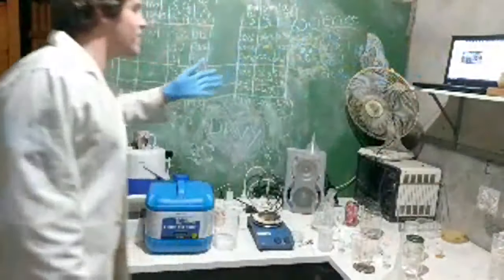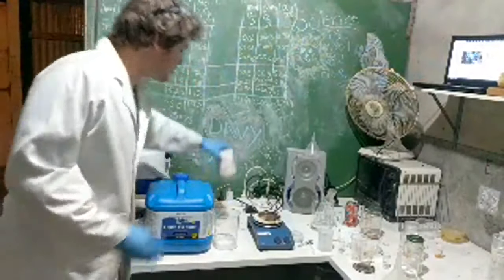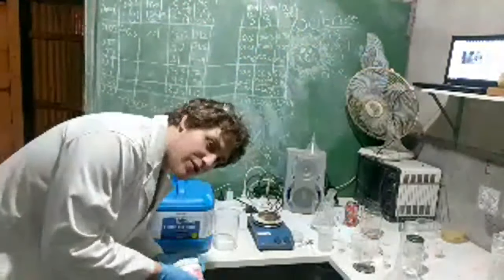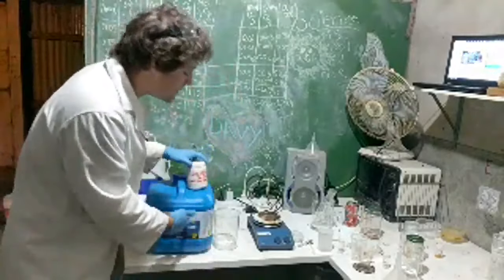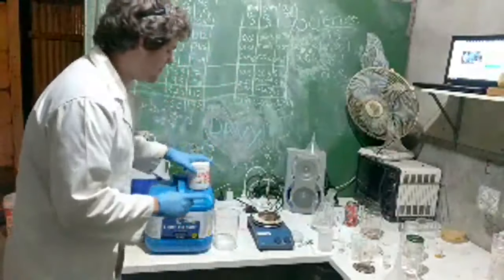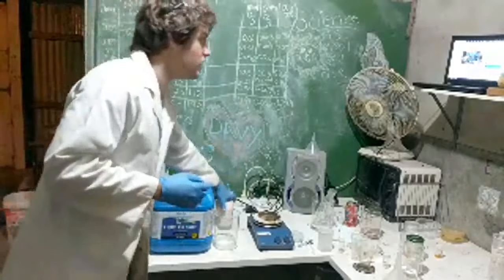Yeah, you're saying iron hydroxide works, but do I need to actually make the iron hydroxide, or can I just skip that step and use iron oxide directly in bleach? If I mix iron oxide and bleach together, does that make ferrates? I suppose we can just find out.